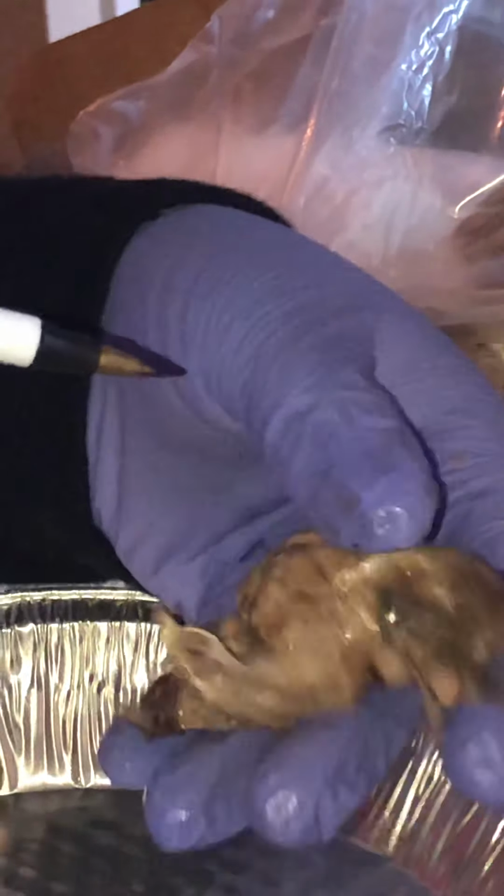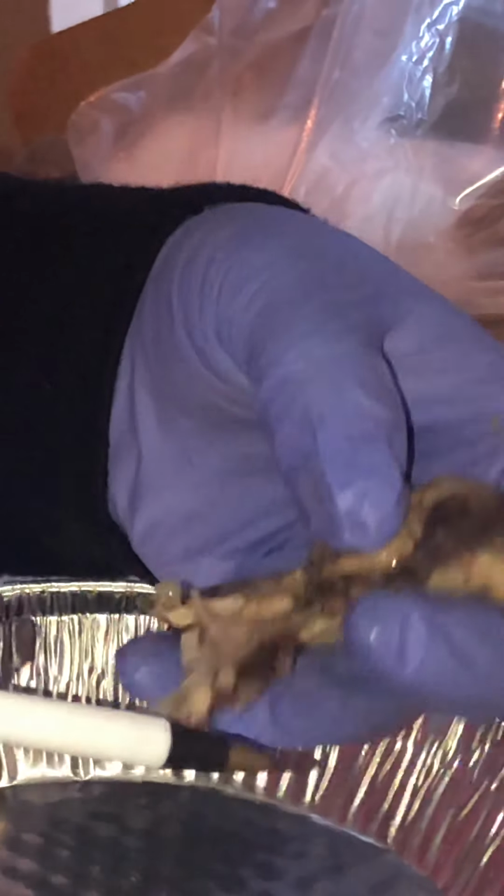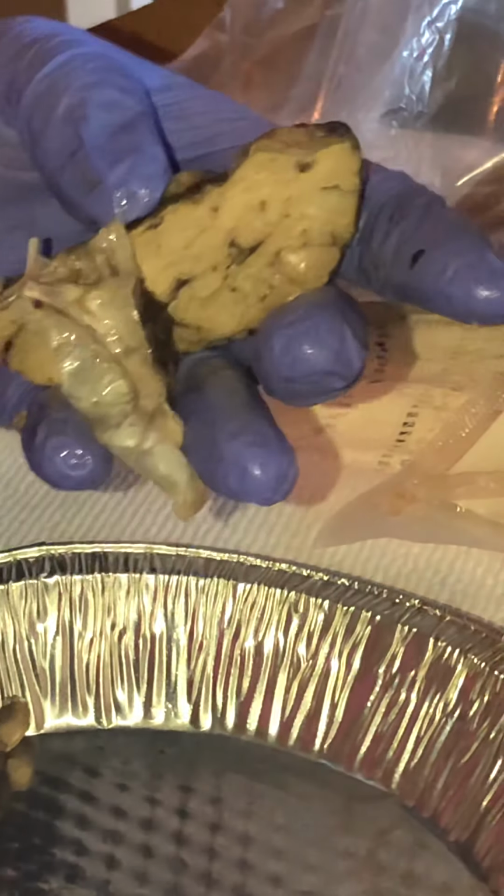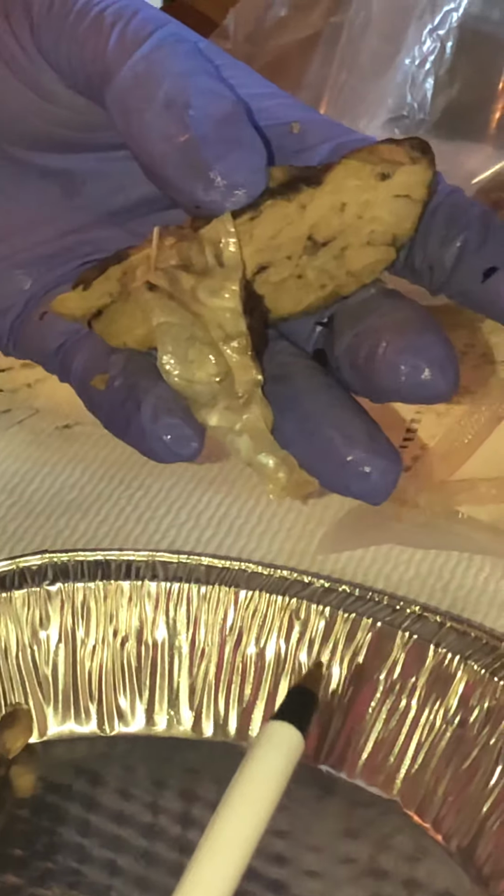So we did the cranial nerve and cranial nerve 1 and 2. I just want to make sure I got 20.